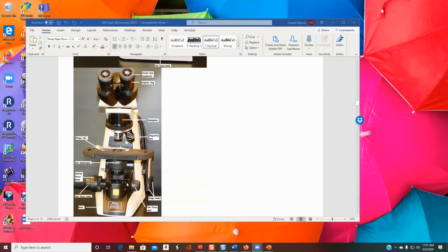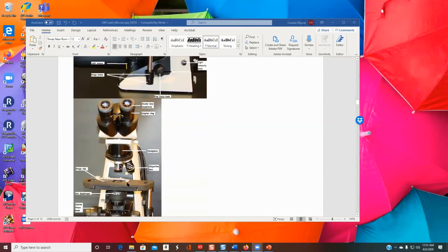No, I can't quite see it. We might see it on one of the pictures we have later. But on each objective lens, there are 2 things. It would be right in this area. One of the things on the objective lens will be the magnification, or power.